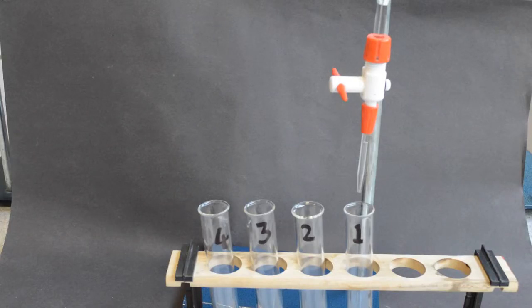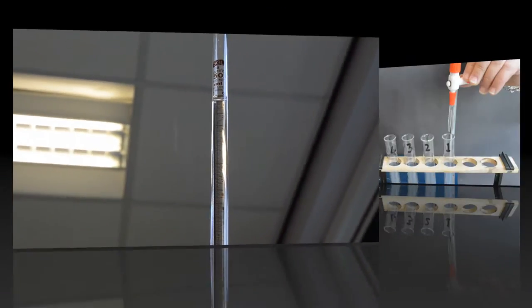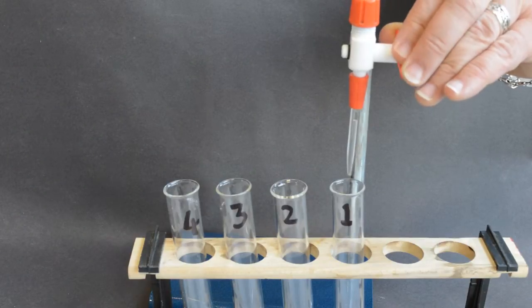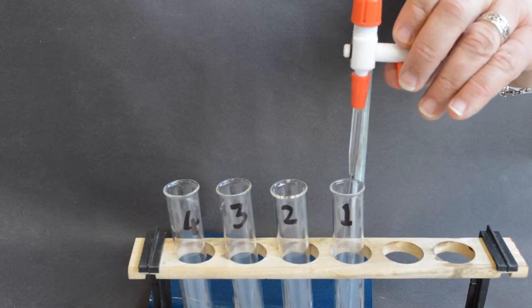Please ensure that the burette has already been conditioned with distilled water, then add the distilled water to perform your colorimetry. Note the initial volume of distilled water in the burette. Into the test tube labeled one, add nine milliliters of distilled water.